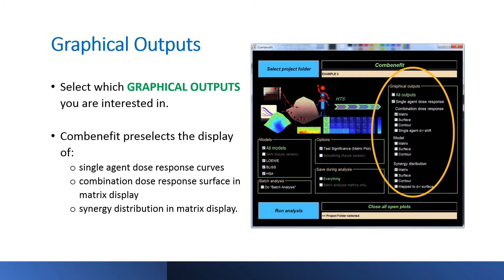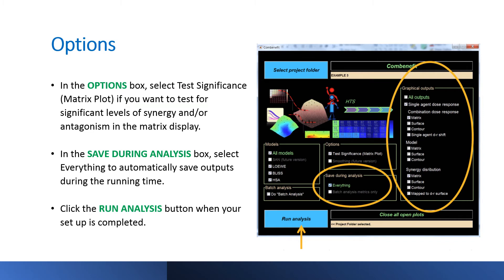Next, select which graphical outputs you are interested in. ComBenefit pre-selects the display of single-agent dose-response curves, combination dose-response surface in matrix display, and synergy distribution in matrix display. You can remove or add other graphical outputs based on your needs. In the Options box, select Test Significance if you want to test for significant levels of synergy or antagonism in the matrix display. Note that for this option you need to have replicates. In the Save During Analysis box, select everything to automatically save ComBenefit outputs during the running time. Click the Run Analysis button when your setup is completed.